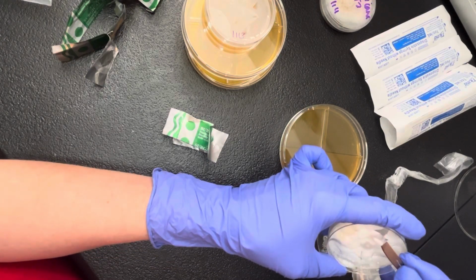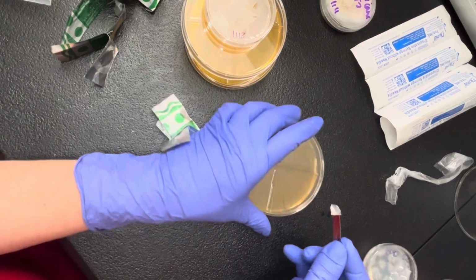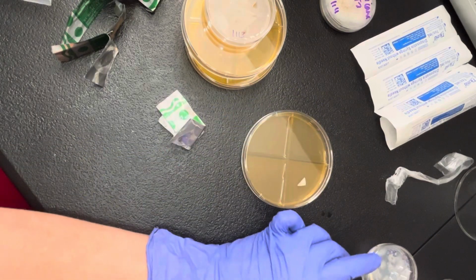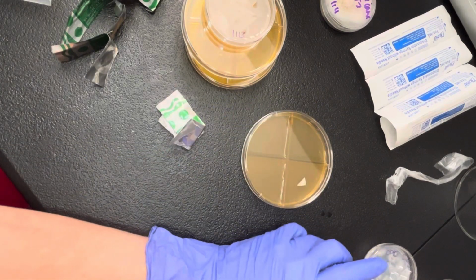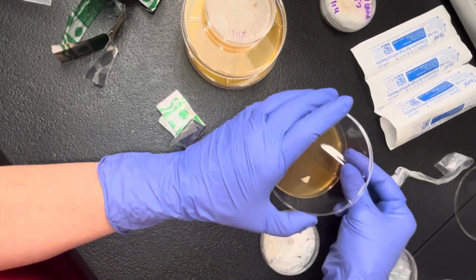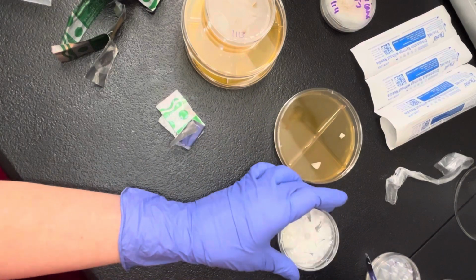Again, holding my plate at an angle. Oops. Because by doing it that way, you're allowing less contamination to fall into it. If you need a little more time, if you're not as quick as I am on the gun, you can hold your plate tilted, or your cover tilted, at an angle.